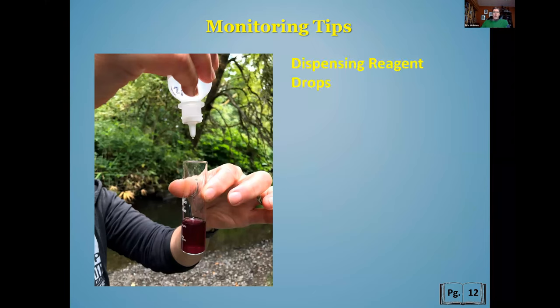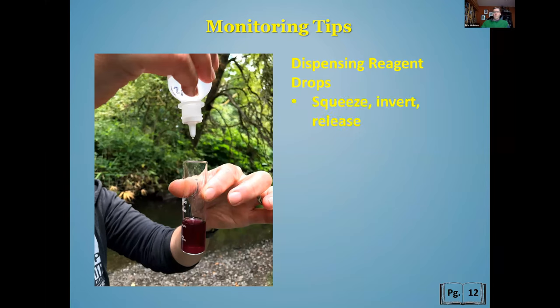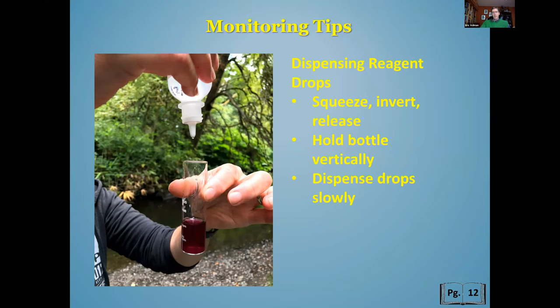Most of the tests are titration-based, which means you're adding a little bit of something until you see a change. You'll be dispensing drops from reagent bottles. The technique is to squeeze the bottle, invert it, release it so it draws in a little air, and then start dispensing the drops. Otherwise they may come out too quickly to count. Remember: squeeze, invert, release, dispense.